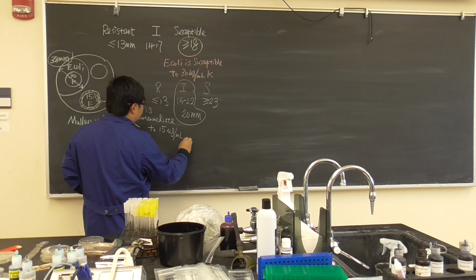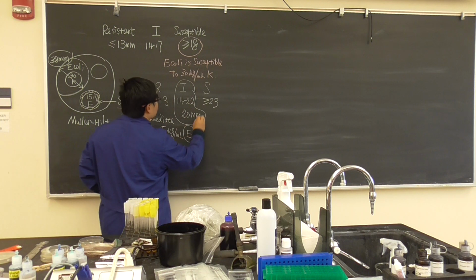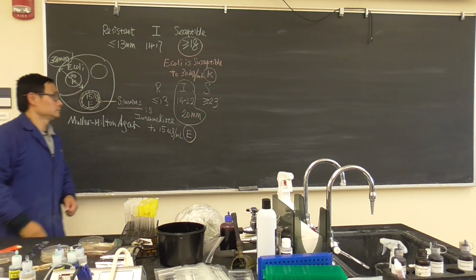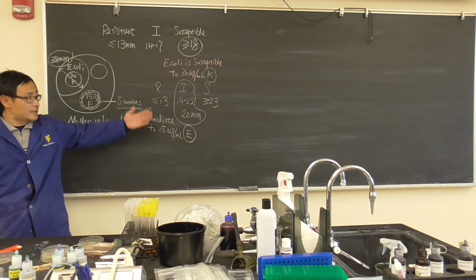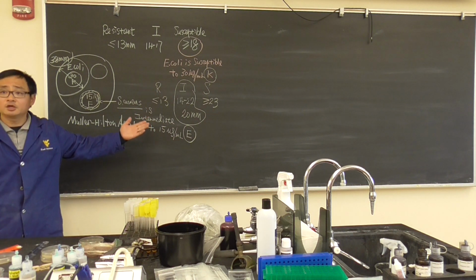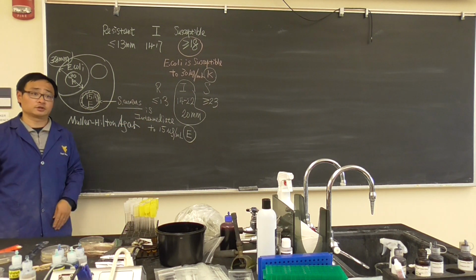It's ppm, okay, 15 microgram erythromycin. We just write it like that. So can the patient use this? No, of course not. It's intermediate. That's why we say this is a semi-quantitative test for antibiotic resistance.